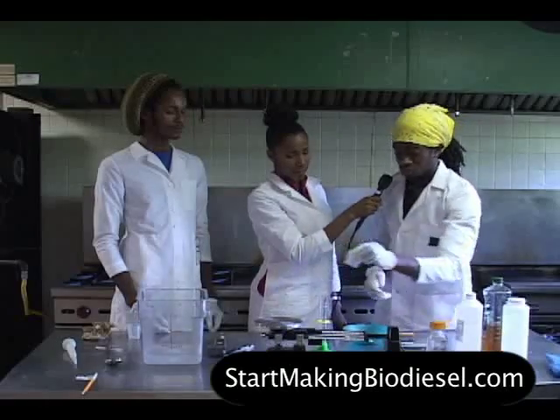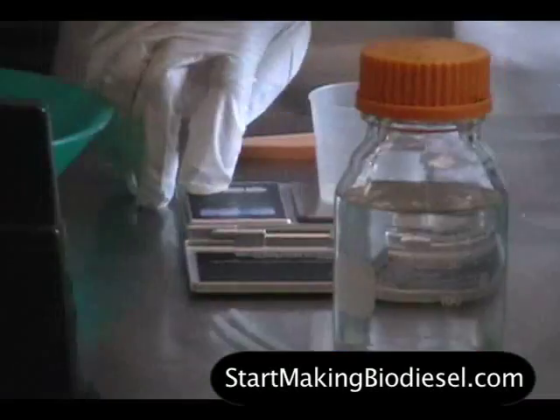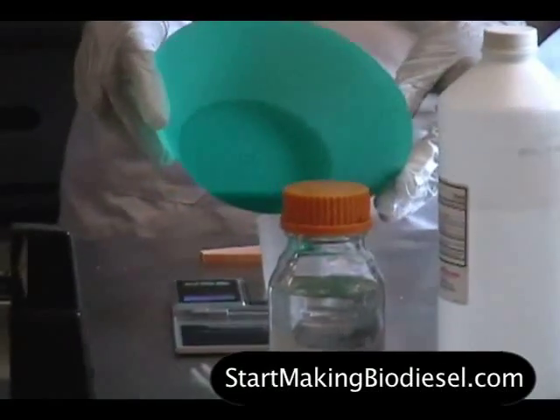When using a digital scale, you just have to place the container on the scale, hit the zero button or the on and off button, and you can zero it out, and then just add one gram of sodium hydroxide.